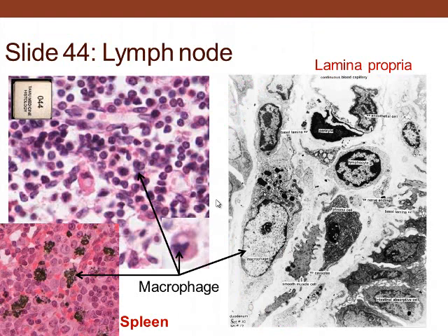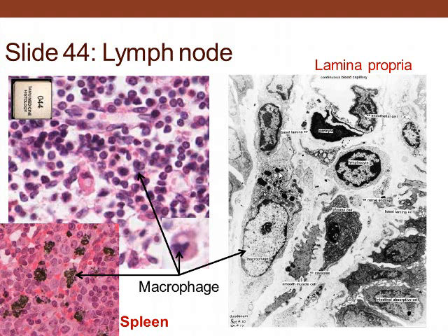In this lymphoid tissue we can see macrophages. This specimen appears to be from a spleen where the animal was injected with carbon, so carbon has accumulated in the macrophages throughout the spleen — these are the cells responsible for cleaning the blood. At the electron microscopic level, the macrophage shows a big nucleus and various components in different states of degradation that it has phagocytized.